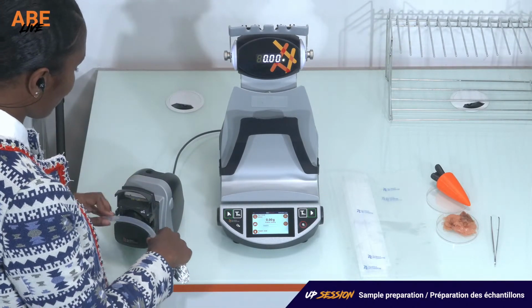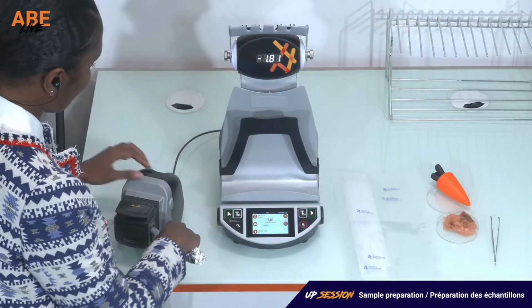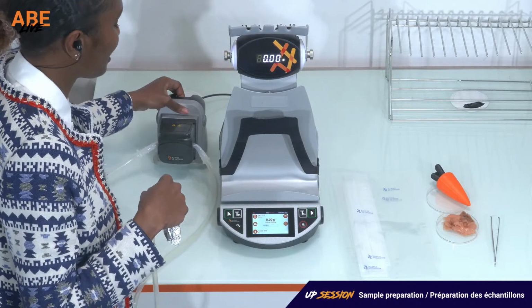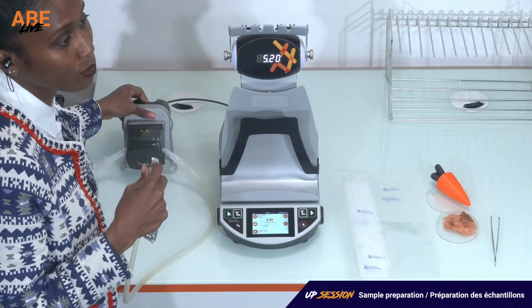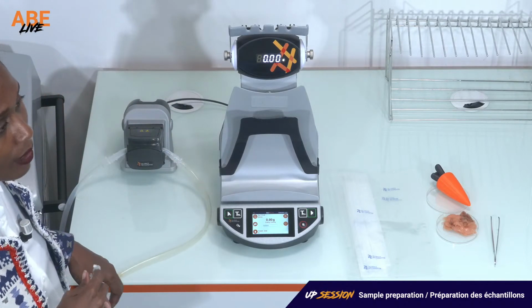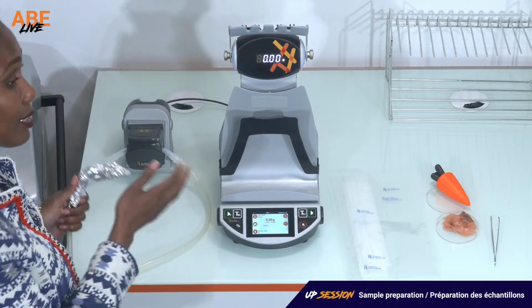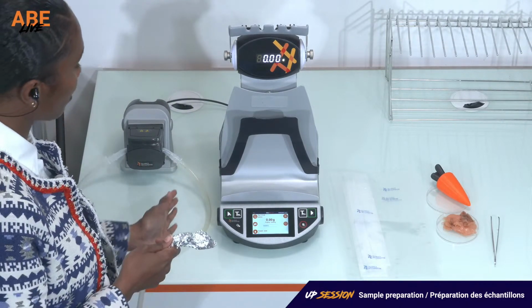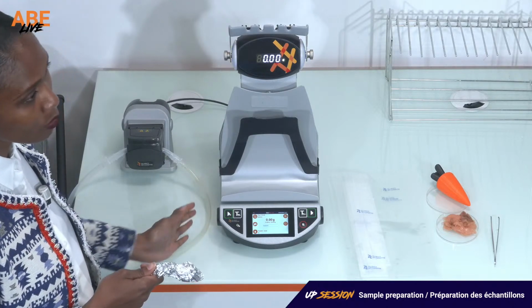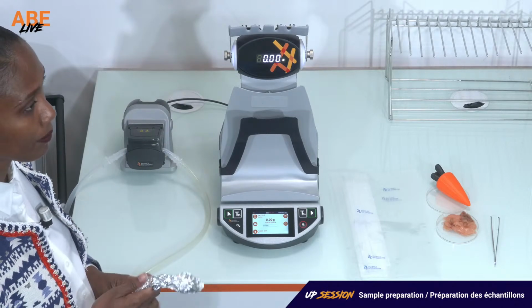No, Sylvain. So, as I said earlier, the diluter is a precision scale. And because it's a precision scale, the ISO 7218 tells us that it needs to be away from vibration. Yes. So, having a deported pump allows us to remove the vibration from being directly next to the scale. So, we respect the standard this way.